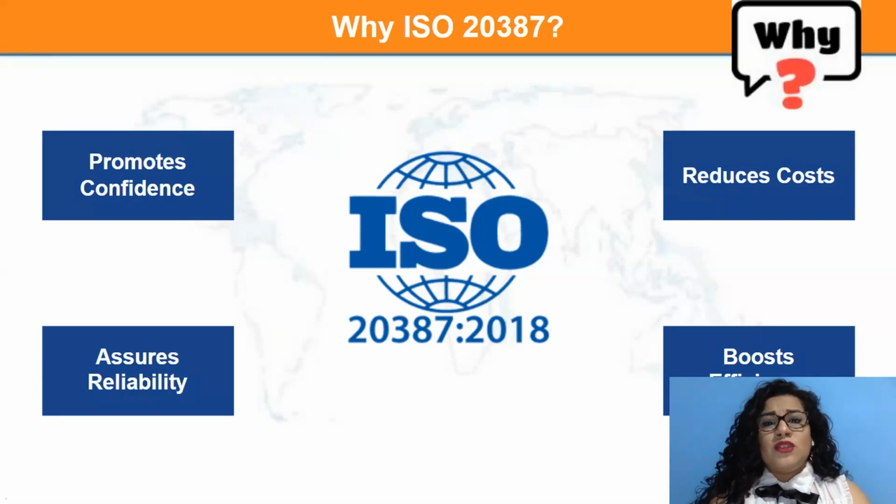Also, ISO 20387 assures reliability in the biobank, since researchers must ensure that samples have been properly stored and maintained throughout their life cycle, and ensure that the experimental data coming from these samples are reliable and can be published in any journal, so they don't have any doubt about the samples and this process of the storing.